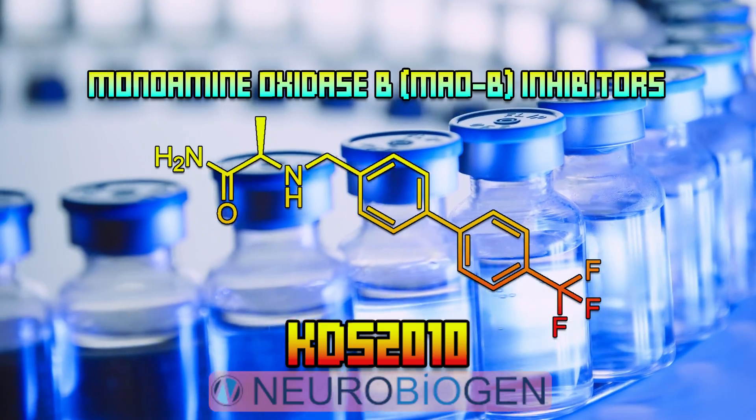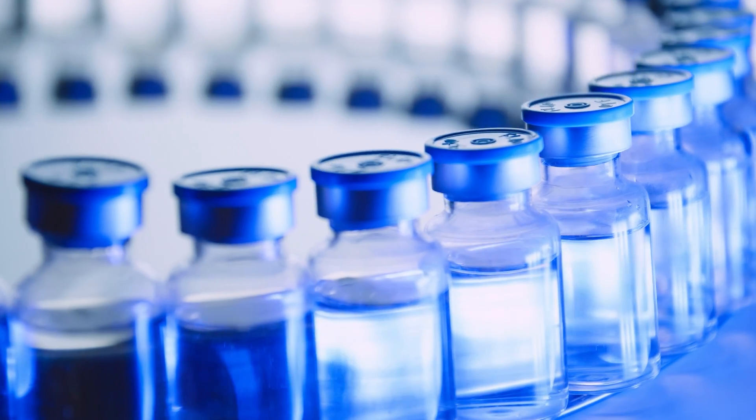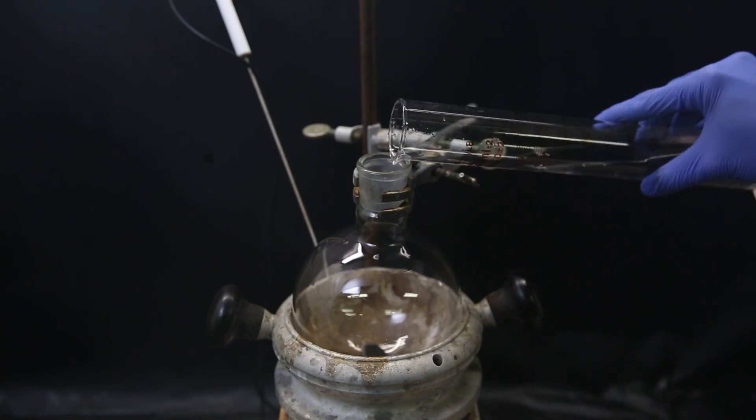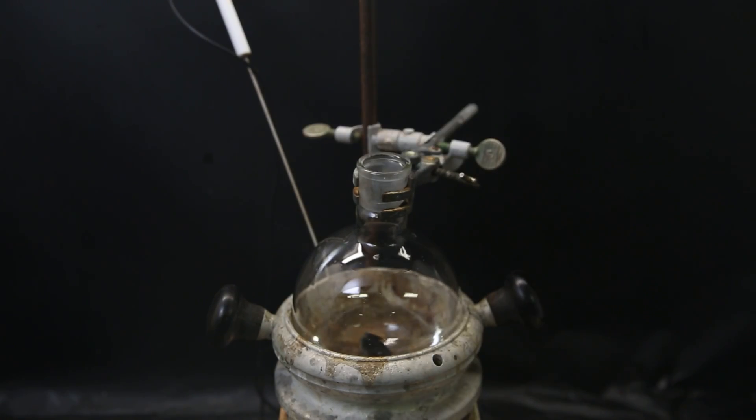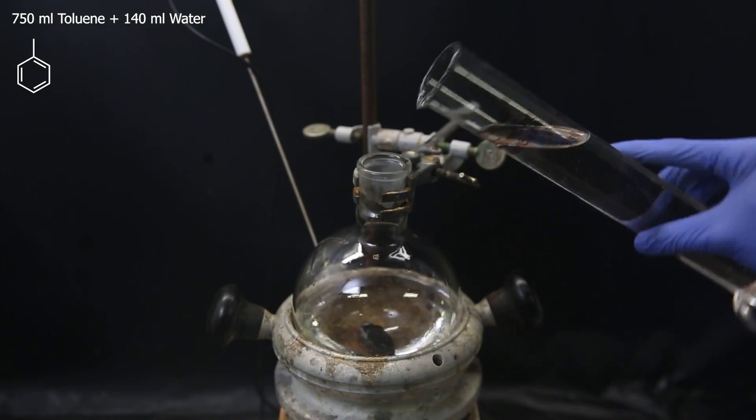So let's just see how it is made, directly stolen from the inventors, with a little tweaking. So to get started, I set up a large flask in a heating mantle and mix 750 ml of toluene with 140 ml of water.